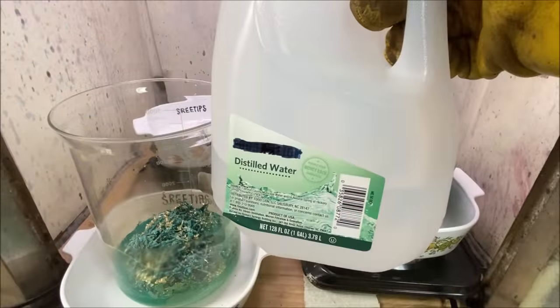This is day four of the experiment. Everything has been allowed to cool off. And what we're going to do here is pour off this copper solution, get rid of it.